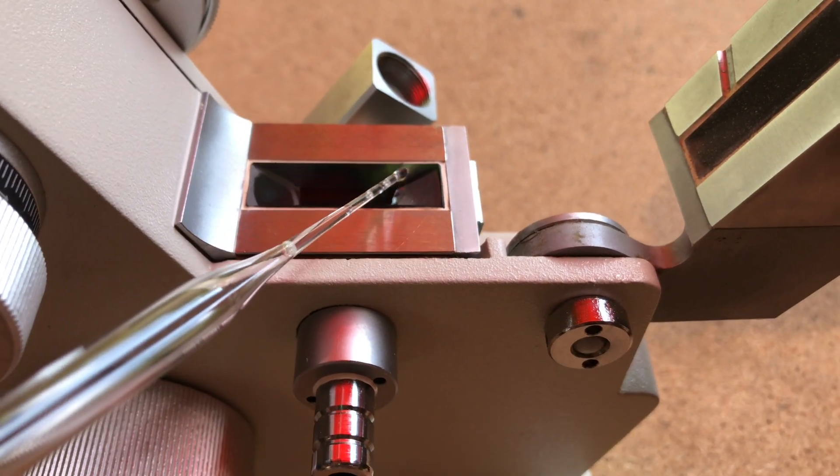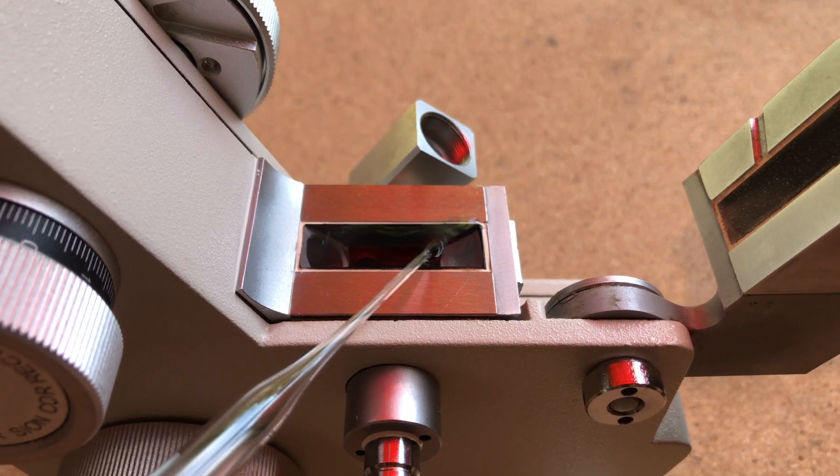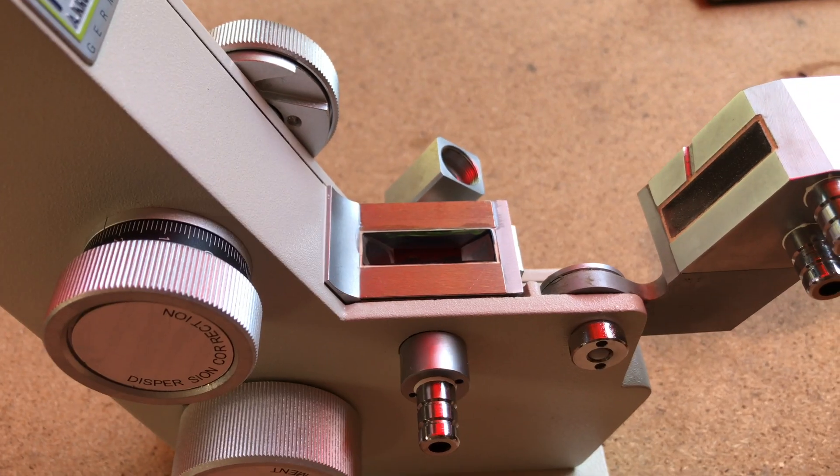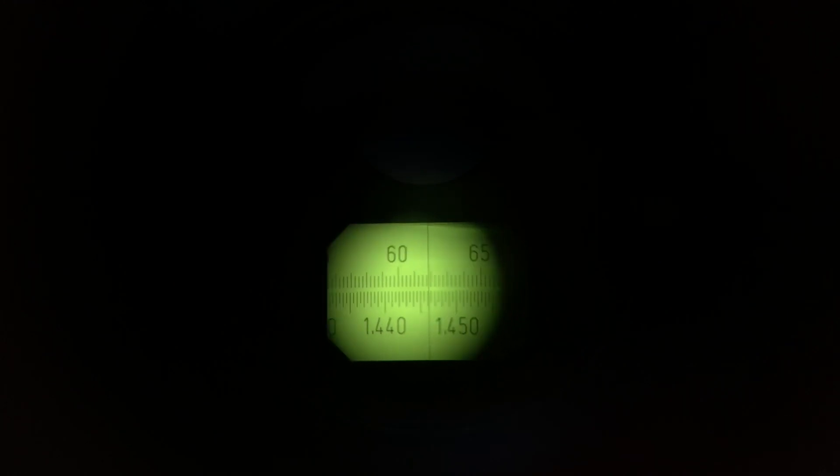One possible route to determine if what we made is actually what we wanted is to use a refractometer. To use it you put some of your sample onto this glass plate and close it up. In the beginning this line up here is blurry and off-center. Using the wheels on this apparatus you adjust it to make it non-blurry and in the center.